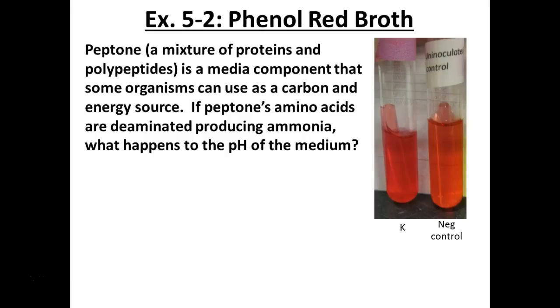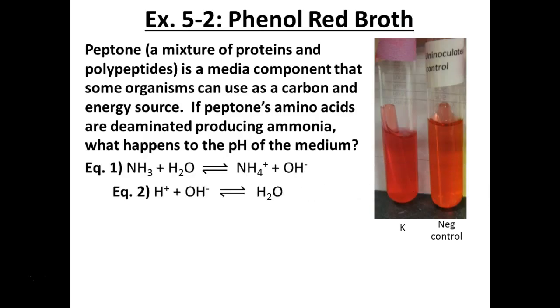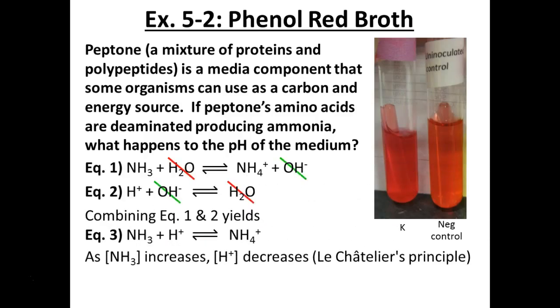Ammonia does what to the pH? It raises it. And so again, it's going to create a color change. In this case, it's going to be that pink magenta color, and we code that K for alkaline, because of course, alkaline and acid both start with A, right? So we got to go with the next letter, K for alkaline.